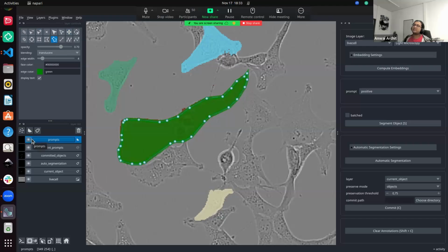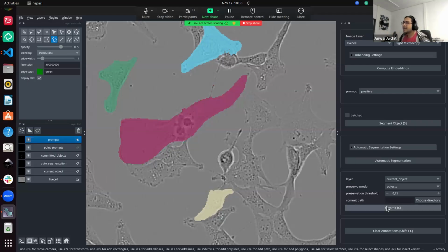It might look like it's fitting around the object, which is also in some potential kind of true, because the idea over here is we kind of trace a mask around this and try to segment using these masks. If you remember, in the beginning I explained to you guys that there will be a point prompt based interaction, a box, or a mask could be provided as well for more fine grained structures. And this is one of those examples. Now we commit this, and then this object is stored as well.